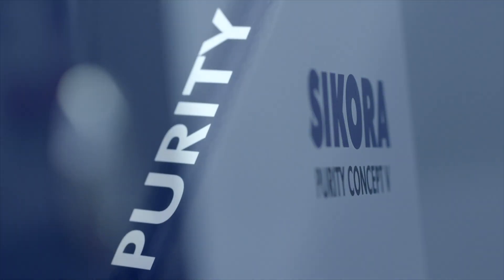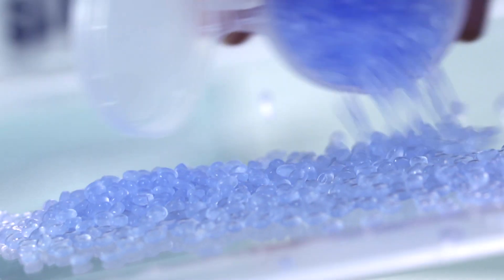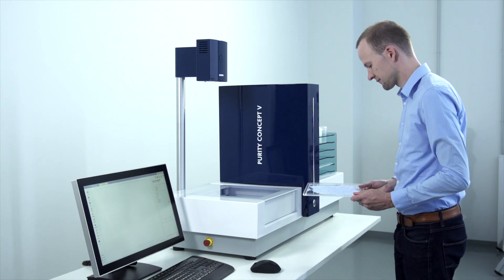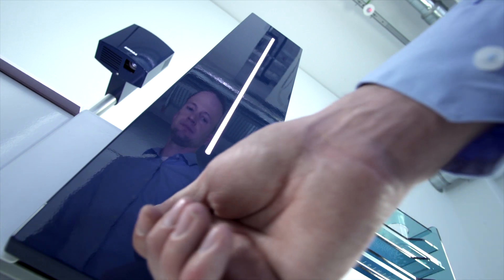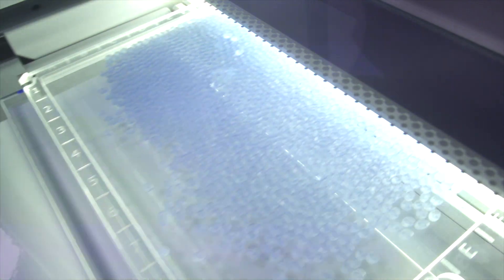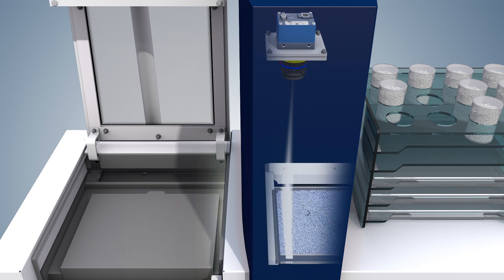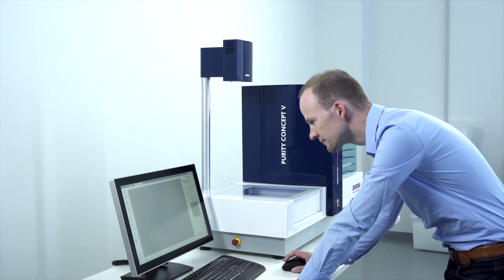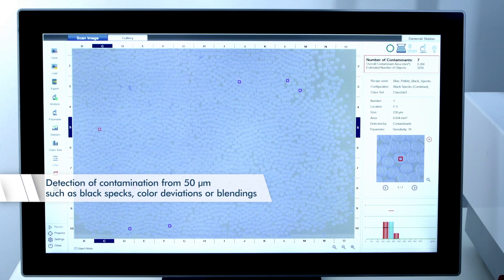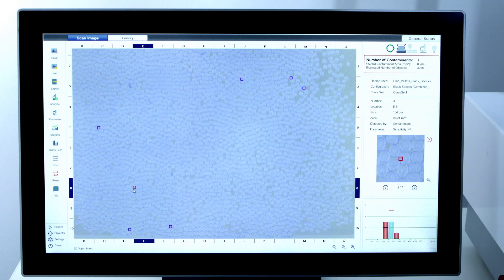Sikora's Purity Concept V is an automated light table for smart sample inspection of plastic material. The Purity Concept V moves material samples on a sample tray through the inspection area. The inspection is done within a few seconds by a colour camera. The Purity Concept V reliably detects all optical contamination such as black specks, colour deviations or blendings, down to a size of 50 micrometres, and this fully automated.